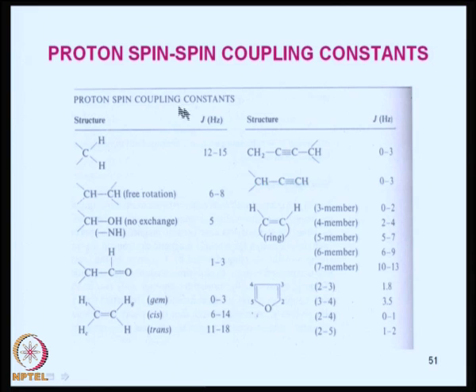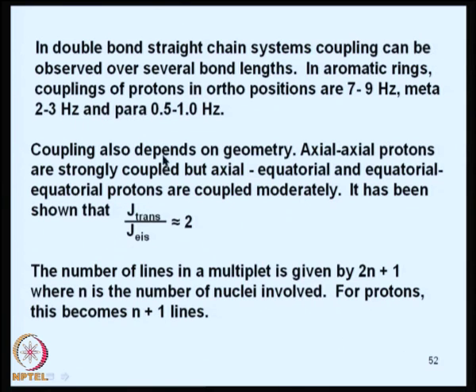So, the proton spin coupling also I have put in a small table. You can go through this and study the proton-proton spin coupling. In double bond straight chain systems, coupling can be observed over several bond lengths.